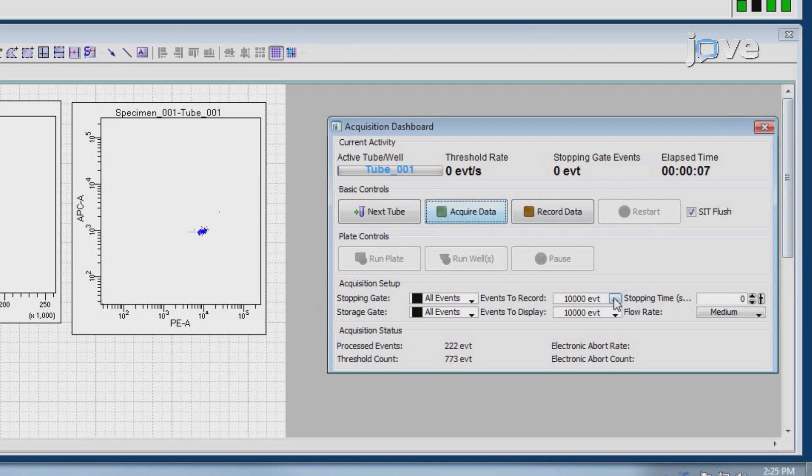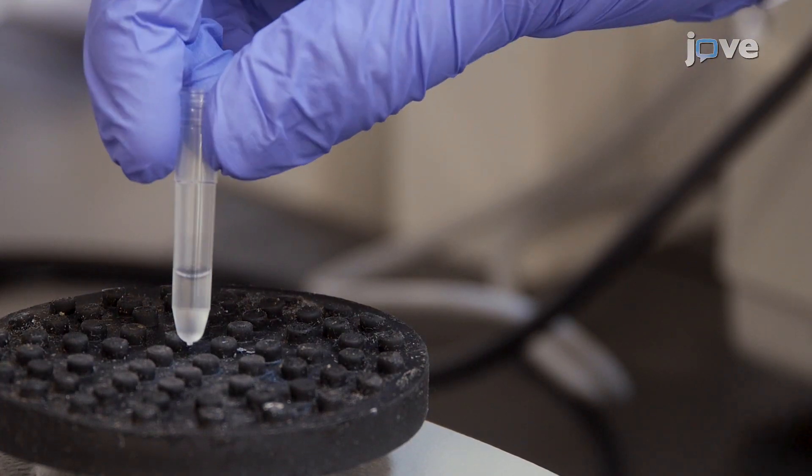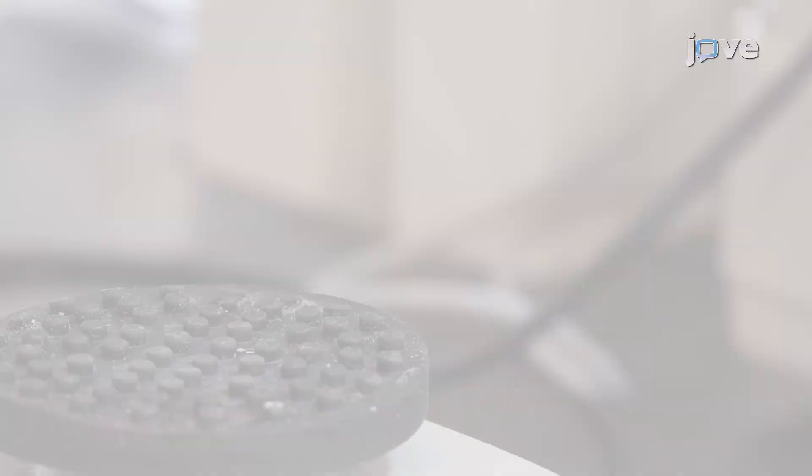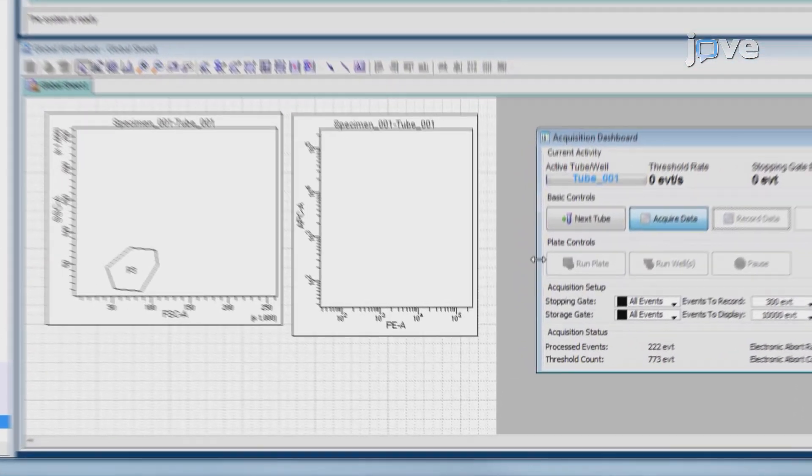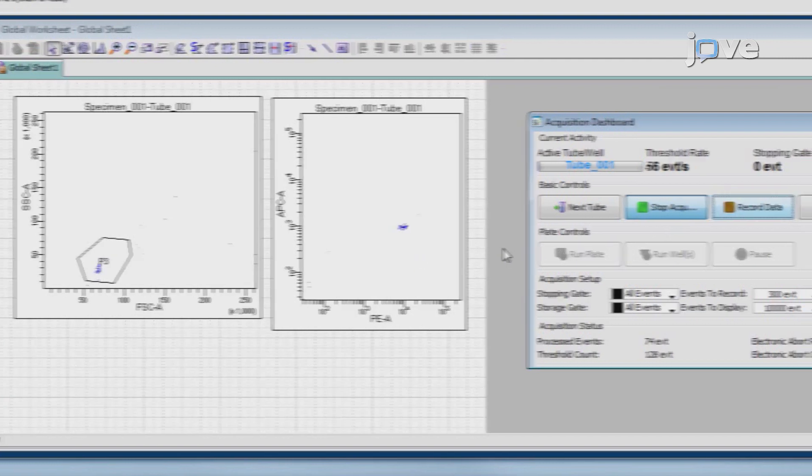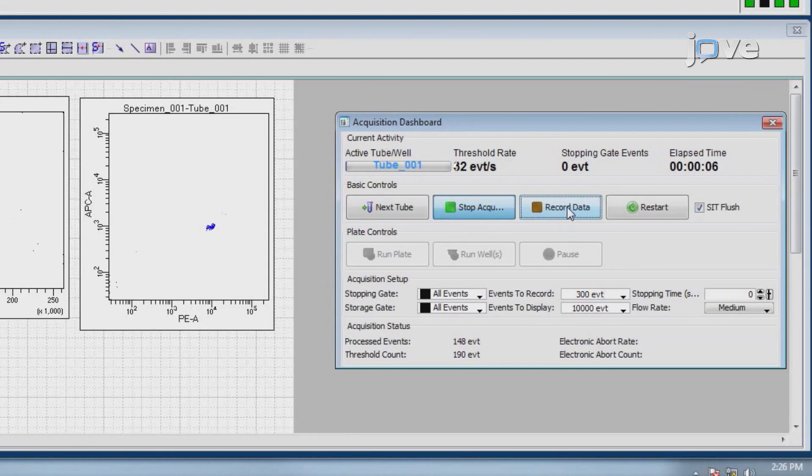To perform data acquisition, set the number of bead events to be acquired to about 300 per analyte. Vortex each sample for 5 seconds before analysis. Then read the samples. When reading the samples, set the flow cytometer to setup mode first and wait until the bead population is stabilized before switching to acquisition mode.